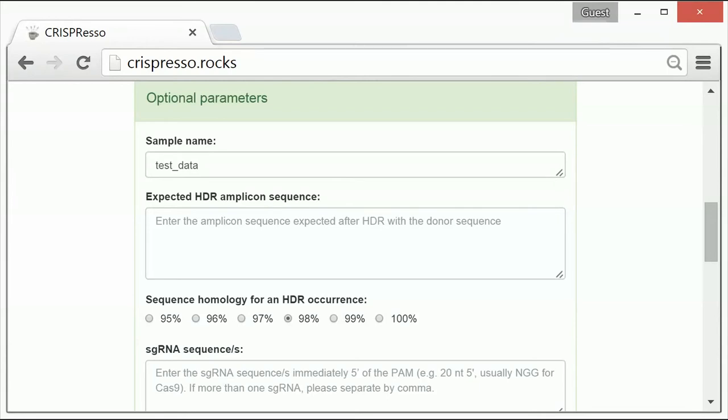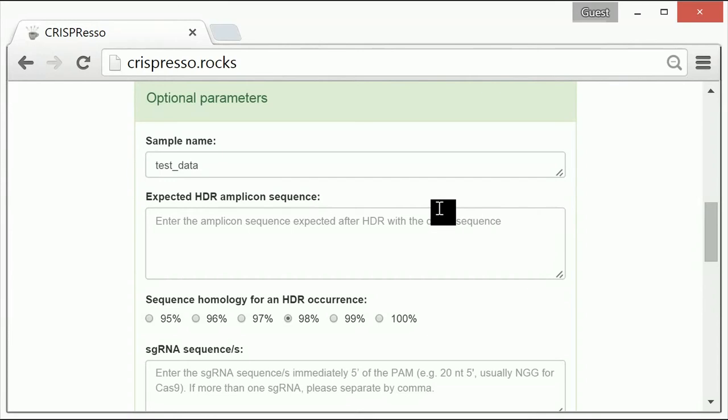The second option in the list is expected HDR amplicon sequence. If the data to be analyzed was derived from an experiment using a donor repair template for homology-directed repair, or HDR for short, then you have the option to input the sequence of the expected HDR amplicon. This sequence is necessary for CRISPResso to be able to identify successful HDR events within the sequencing data.